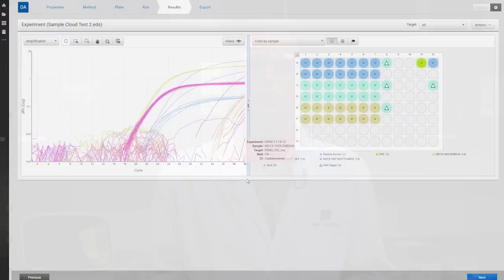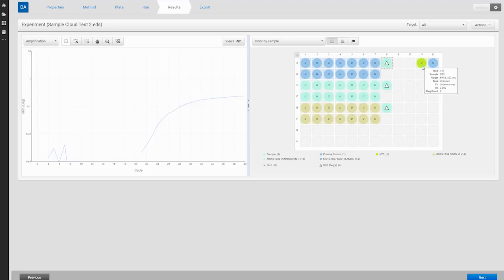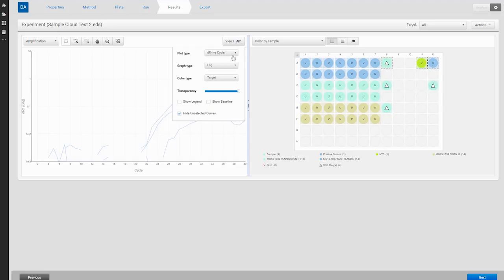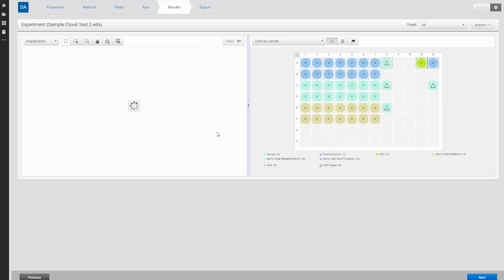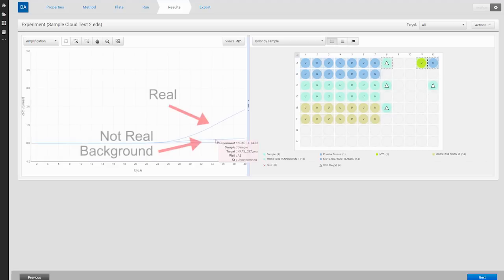You can often tell whether you're looking at true signal or noise by looking at your data in the instrument or cloud software. Here's an example using the Thermo Fisher cloud design and analysis application. These wells are questionable. If we change our plots to linear view, we can see that these curves are actually flat and no amplification is occurring.